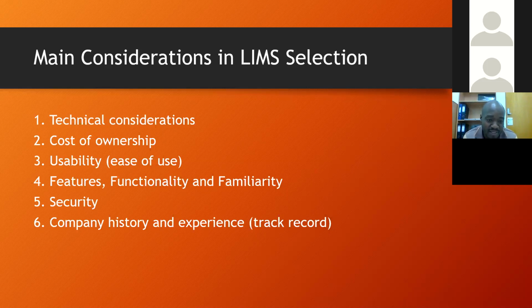So the application must be usable, must be user-friendly, must be easy to use for the end users. The end users being the laboratory clerks, the laboratory technicians, the technologists, the pathologists, anyone who is going to use the application is referred to as an end user. Those people need to be considered at great length because when they go to work, that's the platform that they work from.